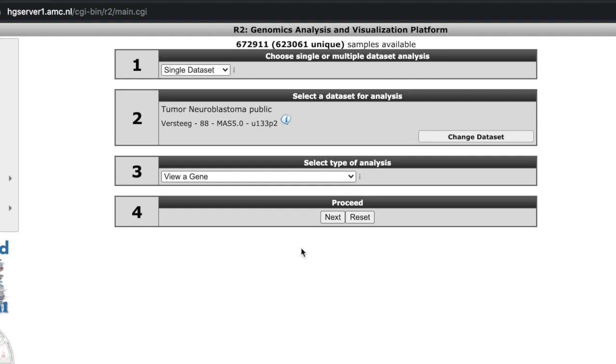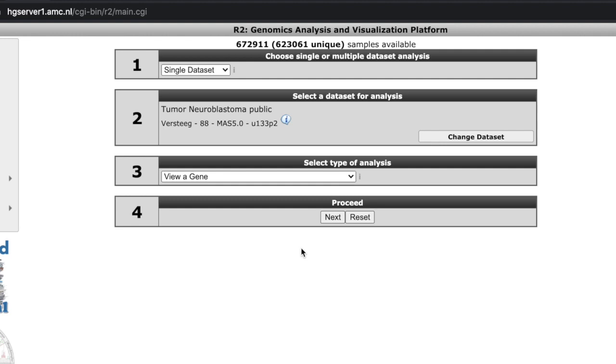There is so much data in R2 genomics analysis, and it's free. It's run by Europeans, which is always better. Europeans have way easier, way better websites that give you way more information than we do here in this country. Like the US is horrible. NCBI is a joke, the way they set things up.